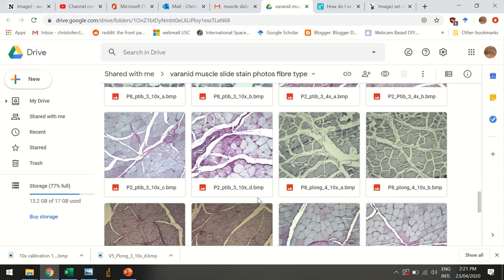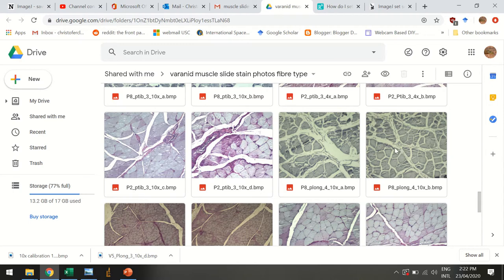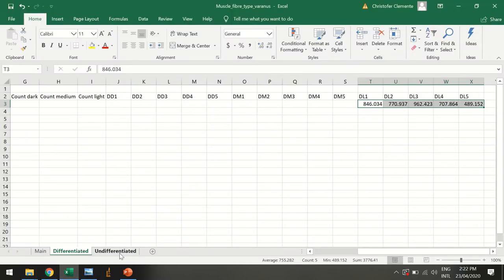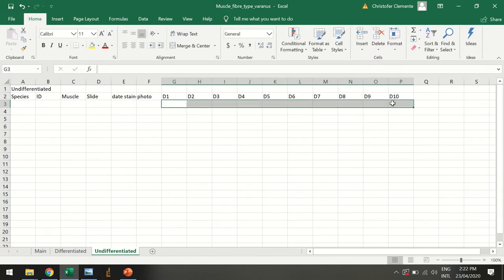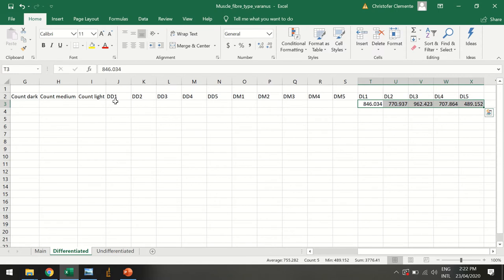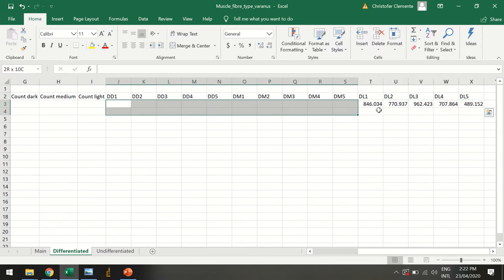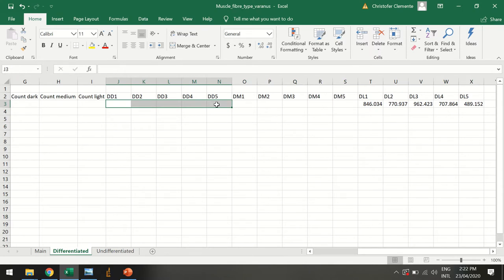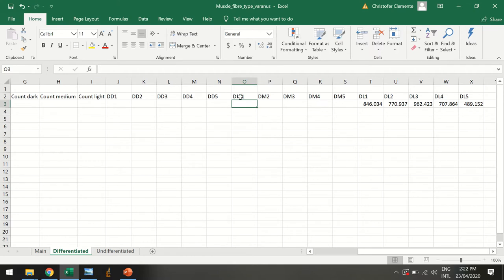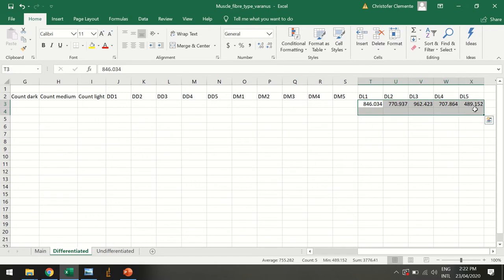Even if they aren't differentiated, like this P8 P long, it's not differentiated but it still would be really interesting to get diameters from them. If they're undifferentiated, we're going to get ten diameters. If they are differentiated, we're going to actually get fifteen diameters, only five though from each different fiber type. So we have the dark which is d1, d2, etc., then we have the medium which is the diameter of the medium dm, and then the diameter of the light which is dl.